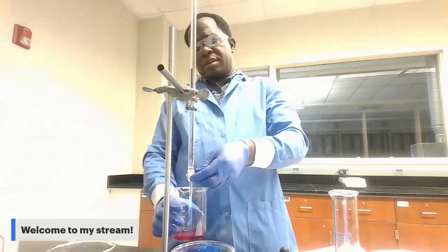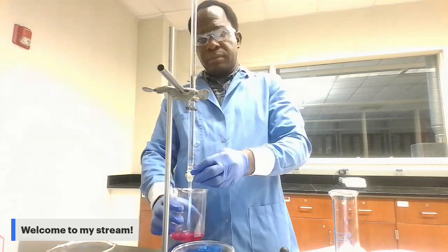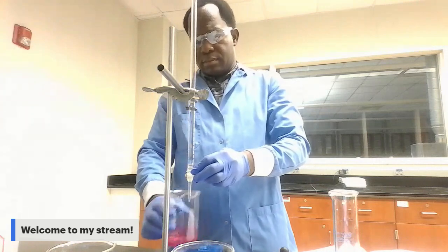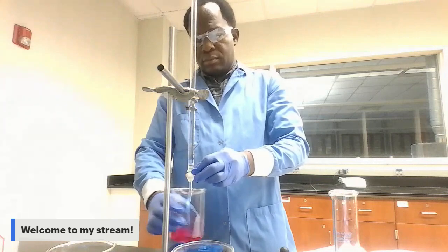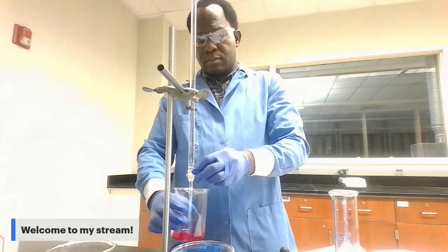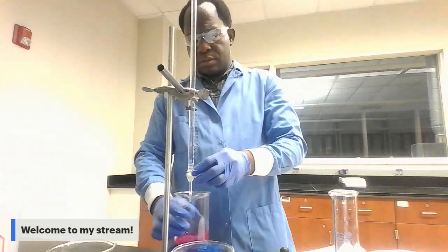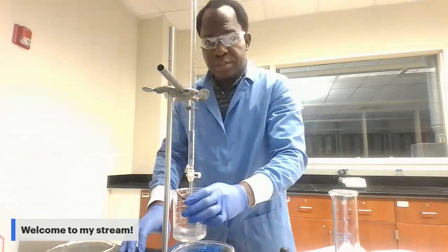So this third beaker. Always watch out for the clear solution. Good, we get to the equivalence.